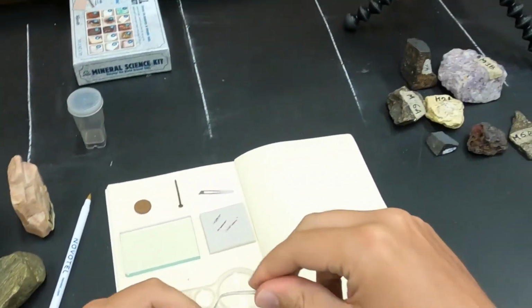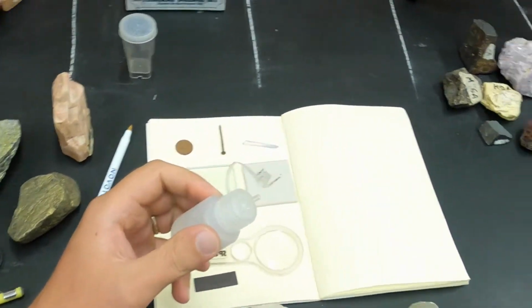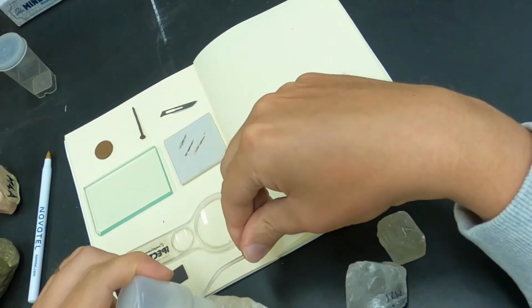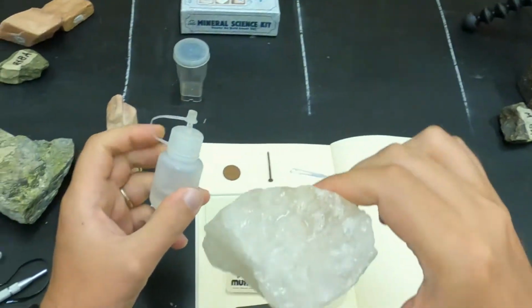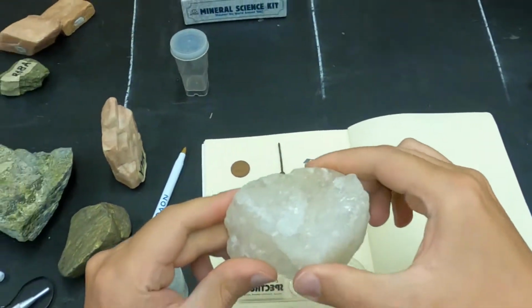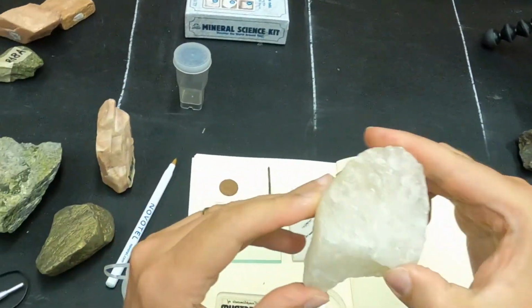Of course, if you don't have carbon, like in this case of silica, so this is an oxide of silicon, you don't get really any reaction. I don't see any fizzing, not much really happening with this mass of quartz.